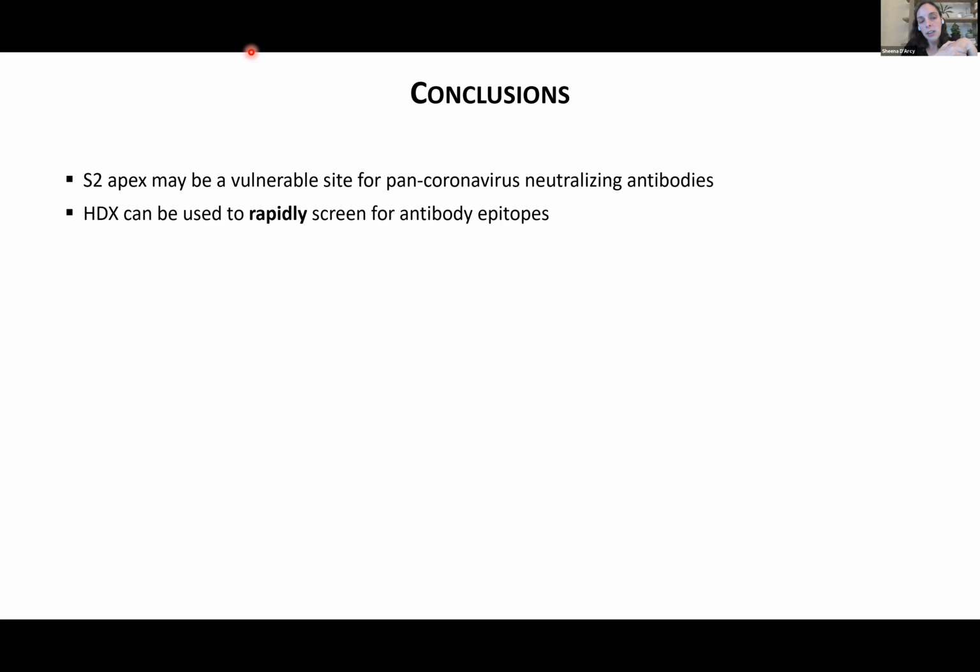And so the affinity really only becomes an issue if you can't have whatever your molecule of interest is in excess. So for the antibody experiment here, because we were only interested in looking at peptides from the spike protein, we actually did it at 1.25 fold. So we were really making sure we saturated the binding site, just like in the CK2 alpha, where we had those fragments at way high concentrations. And that is a step for us for every single experiment.